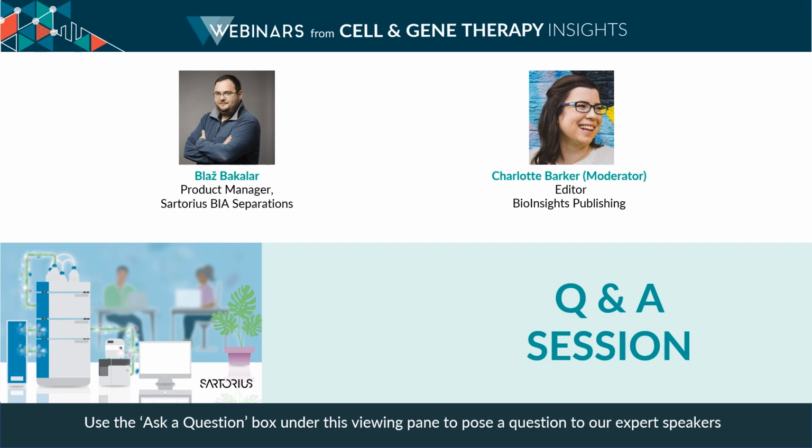Okay, so next question here, Blaž. For the fed batch mRNA production, you improve your yield, but do you see any increase in dsRNA levels compared to non-fed batch production? So for this one we didn't see any increase. There was also some interesting stuff that I saw at a conference recently when we've been playing around with limiting UTP concentration to bring the potential for double-strand RNA down even further, based on some very old research.